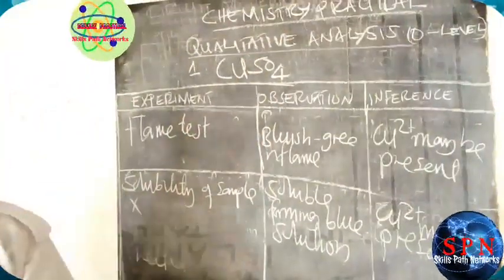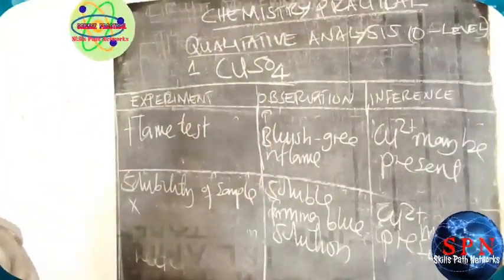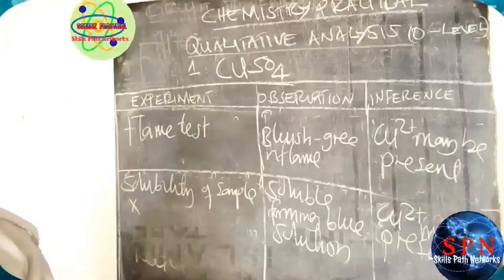That is solubility. After solubility, we go to the action of dilute hydrochloric acid.